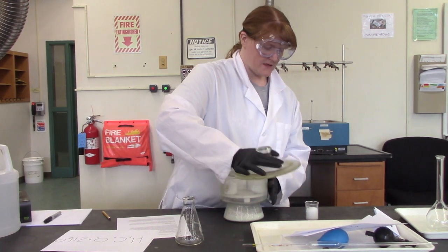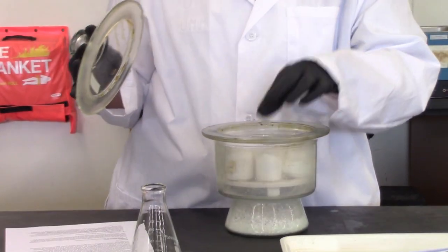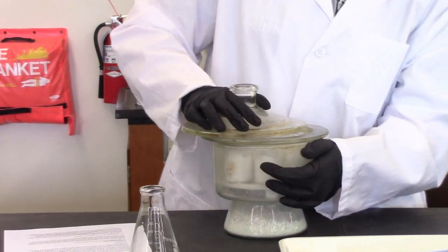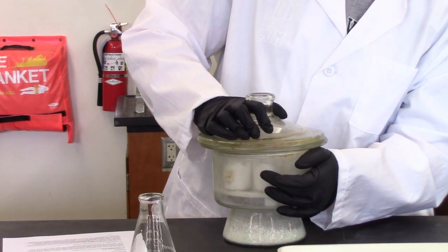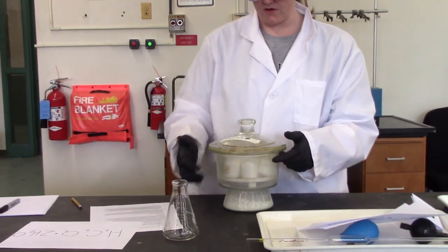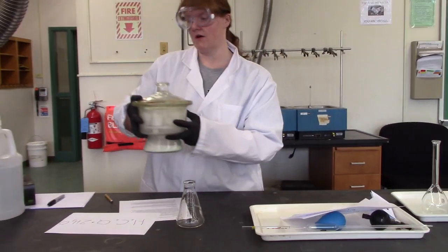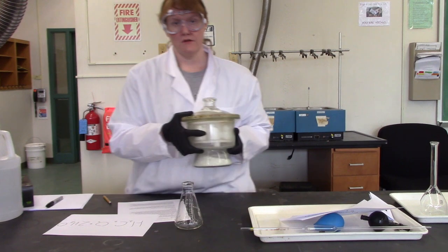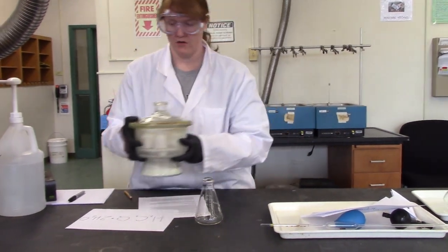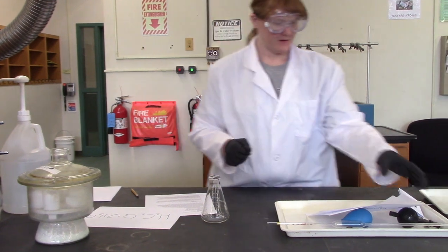You'll notice that these are in small containers. They're not in the giant jar that we get from the manufacturer. That's because we don't want you to stick your spatulas in our stock jars. It's okay to put your spatula in these ones for the purposes of measuring out how much you need. Before you do this, make sure you check with your teacher to make sure you have the right amount.